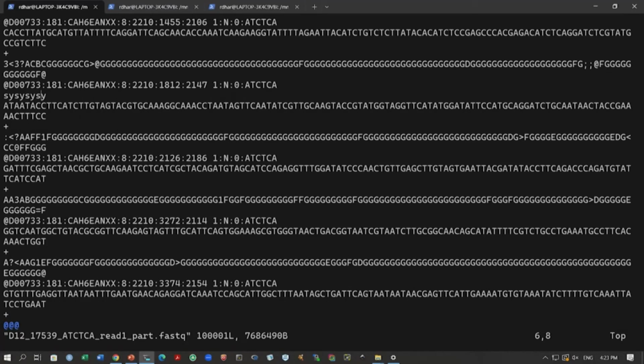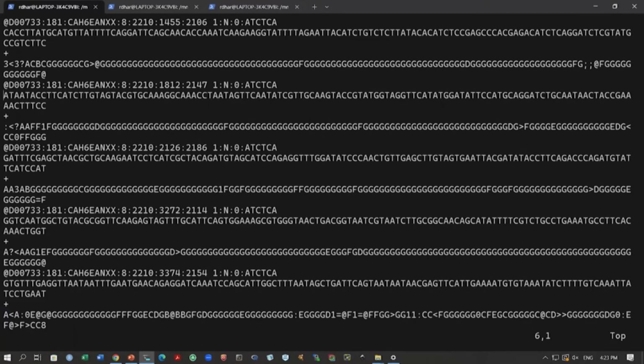So, these are some of the basic commands that we can use. Of course, there are many more commands, many more functionalities, and that is why vi is really powerful. We can do a lot of things in the terminal just by using vi and opening the files, and there are commands within vi that work very well and can help us navigate these files very easily. We do not have to always traverse through the files or through the lines. We can do a lot of things very easily using simple commands inside vi.